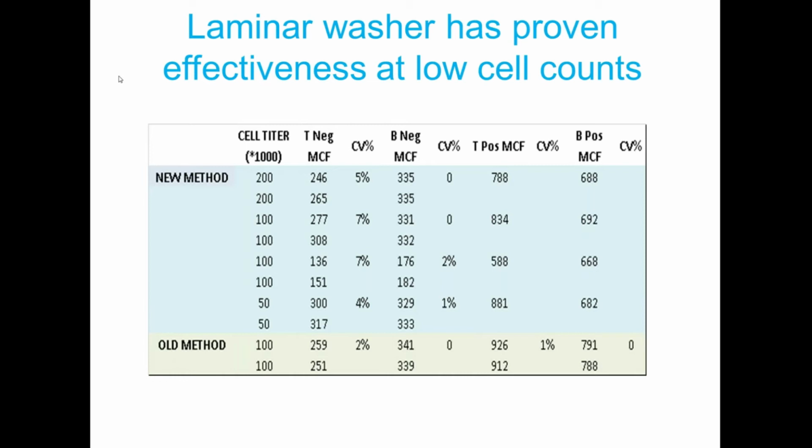So you hold your breath as your first sample is acquired on the cytometer after 3 to 6 hours of labor, and you see only 10 tiny dots in your gate. An invalid crossmatch result, you have nothing to report to the transplant surgeon, nothing to predict whether the patient will be fine after the transplant.